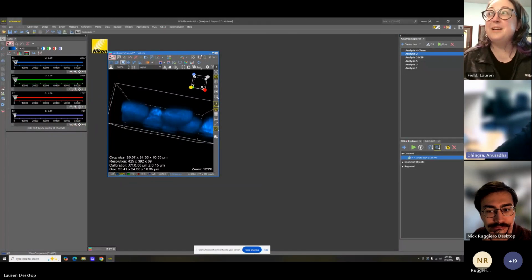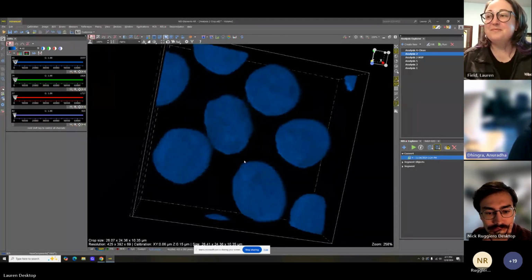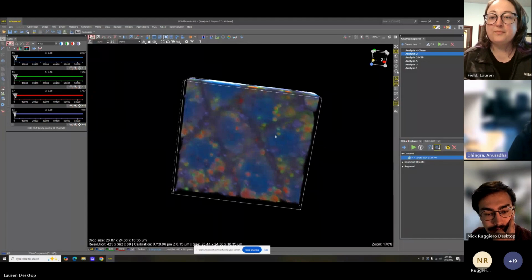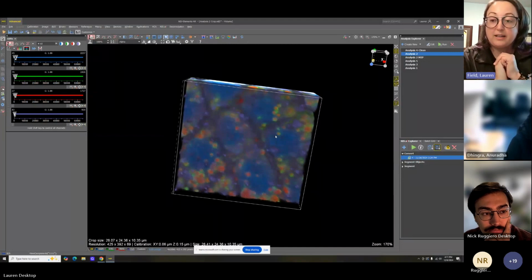Hi, Anu, thanks so much. This is really helpful. So in the apps right now, since we don't have the volume version of it, does it make sense to just do a single good layer? I ran this on a maximum intensity. You could also run it on a single layer. I would test it and see if you get dramatically different pieces of information.